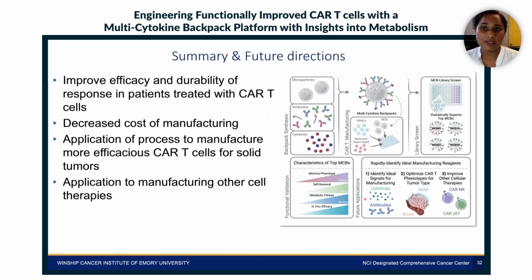And so in summary, we think that this platform can be used for a variety of different methods. As I showed you, our library was able to create particles of diverse formulations. And then we were able to test this in a 96-well format in which we identified statistically superior multi-cytokine backpacks that were functionally superior, and then they had memory phenotypes, evidence of self-renewal, metabolic fitness, and enhanced in vivo efficacy.